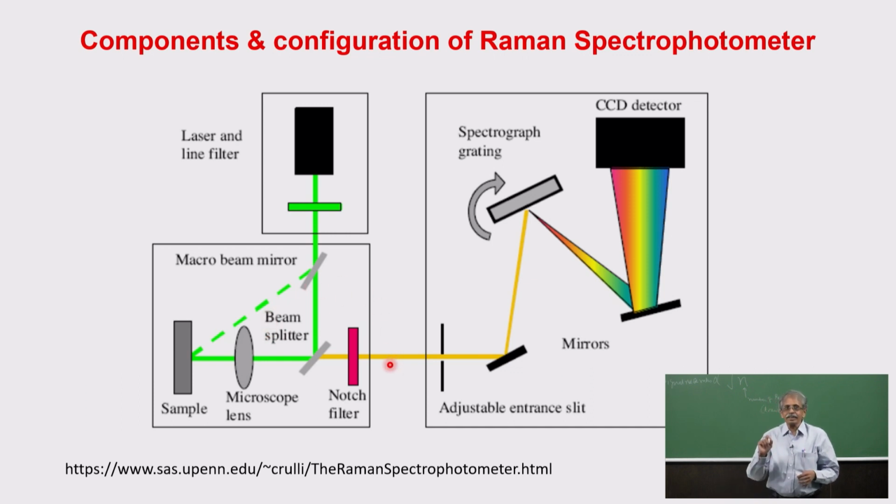So the 90-degree scattered radiation is more in the Raman direction, and it has less of the other scattering. Of course there are all the optical modifications and resolution, and then the detector finally. So this angle is referred to as the 90-degree angle.